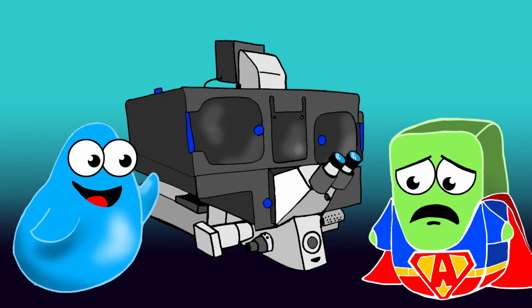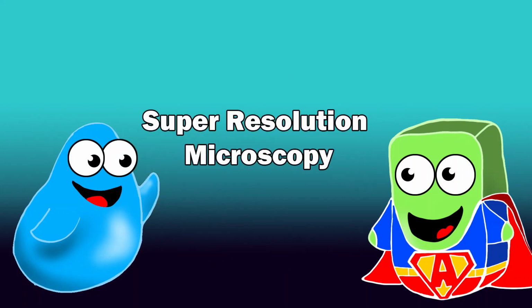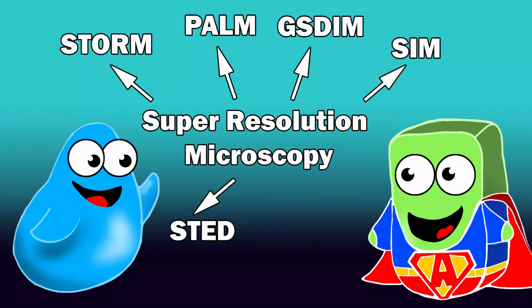No, but you can think of it as a light microscope with superpowers. Super resolution microscopy actually describes a bunch of different specialized techniques that let you get high resolution images using photons as a source of illumination.